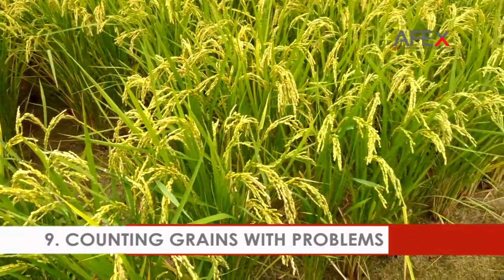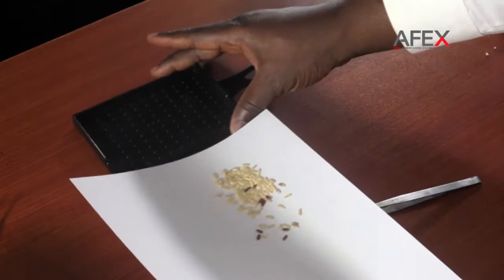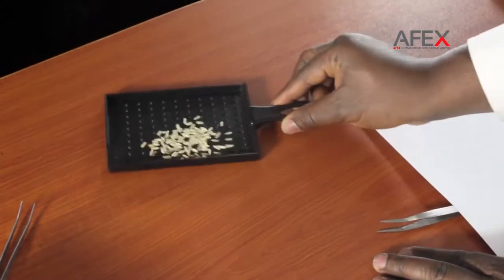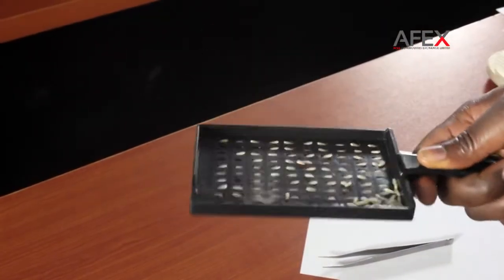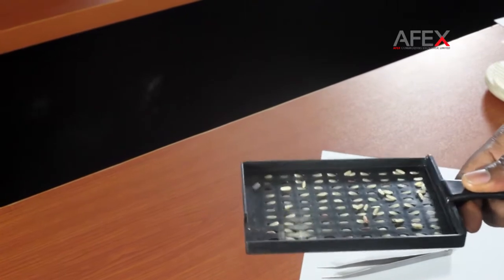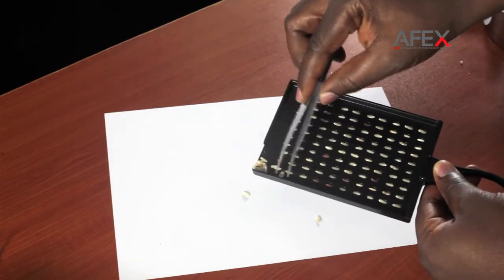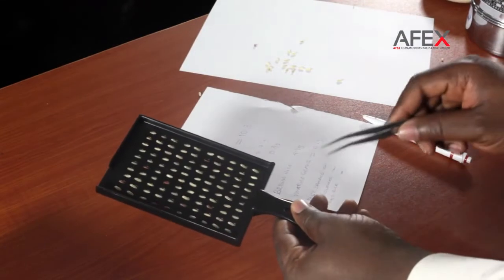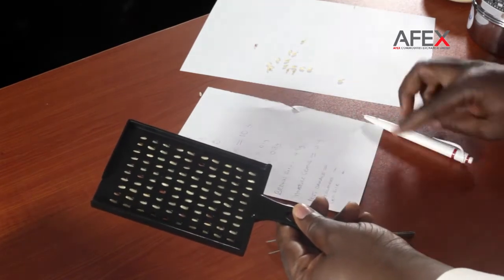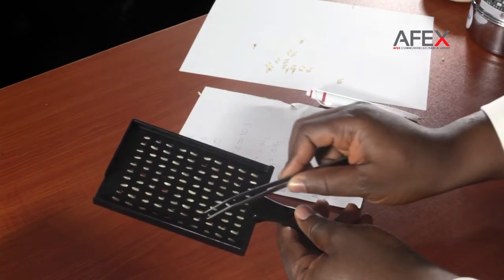Counting grains with problems. Put the separated whole grains in the grain counting pan and remove grains not fitted in the concaves. Make sure to fill all concaves. The counting pan has 100 concaves, so you can directly know the percentage of problematic grain types by merely counting them. For this procedure, we have pest-damaged grain as 1% and discolored grain as 1%.